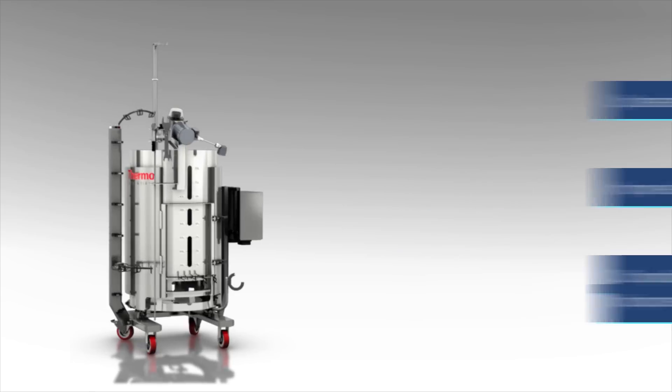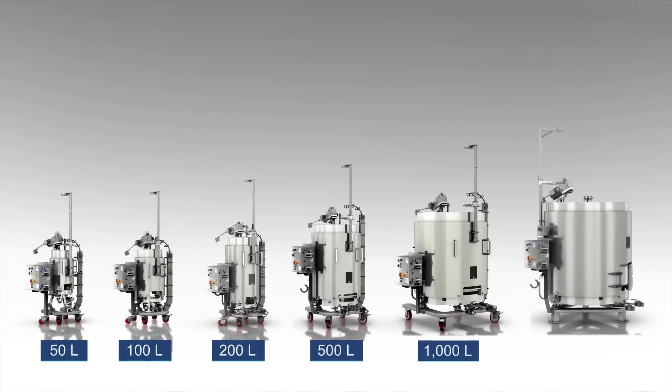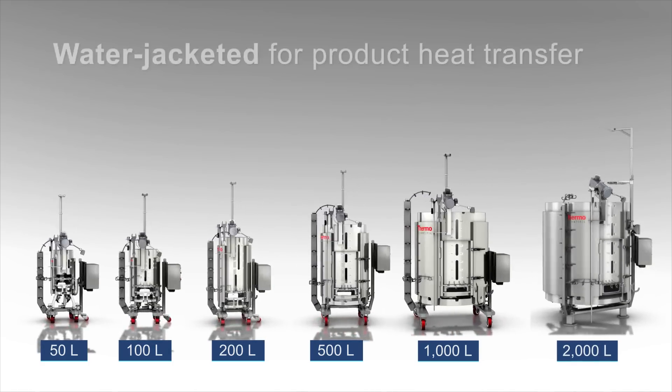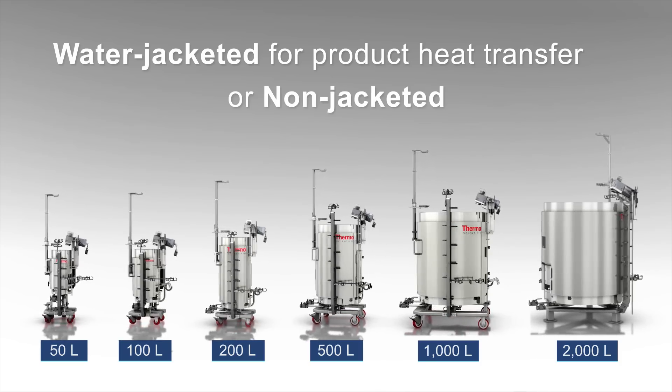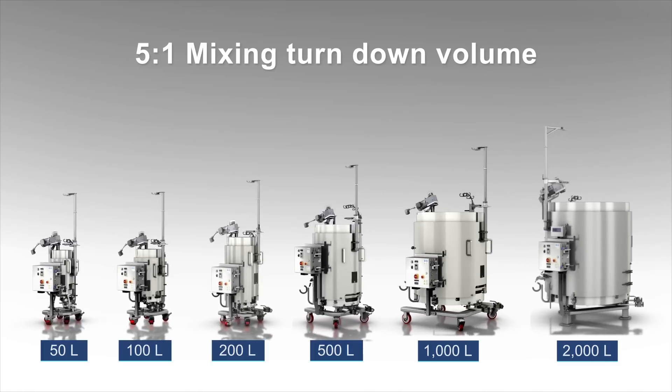The SUM is fully scalable in 50, 100, 200, 500, 1000, and 2000 liter sizes, is available water-jacketed for product heat transfer or non-jacketed, and provides a 5-to-1 mixing turndown volume.